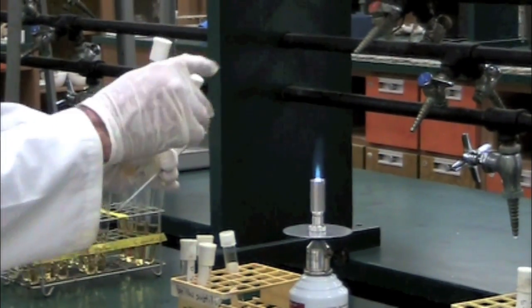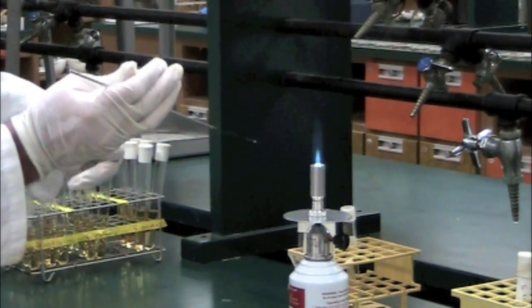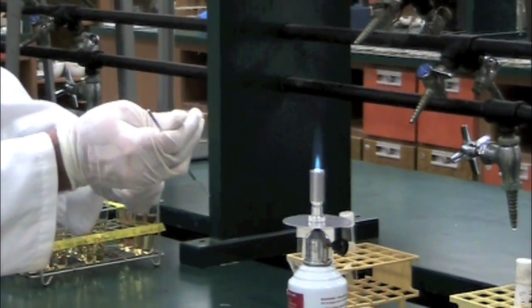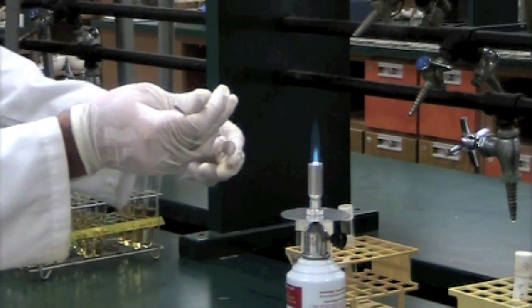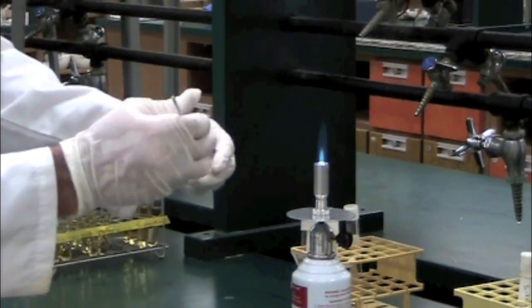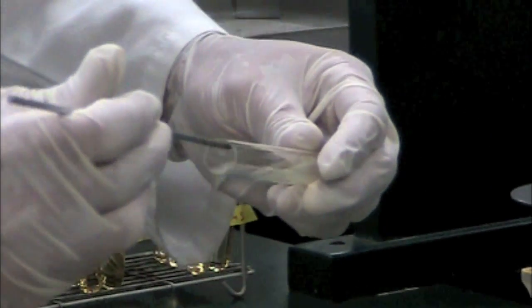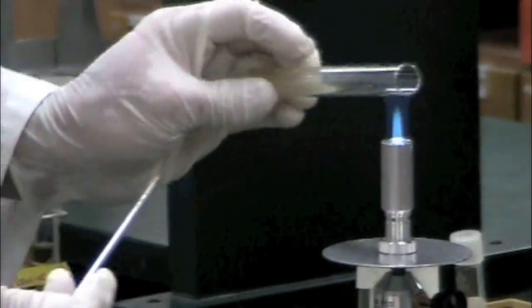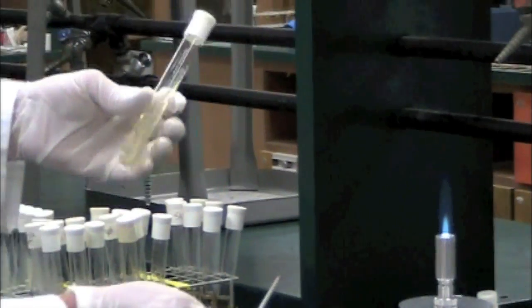Okay, I'll now replace my organism, and once again I'm going to take the cap off my sterile tube, flame it, and introduce my organism. And on the slant, what I'll do is I'll spread it around. Remember, we talked about the surface area. I've got a lot of surface area now to grow the B sub. Reflame the tube, recap it. You've just seen an aseptic transfer from slant to slant.